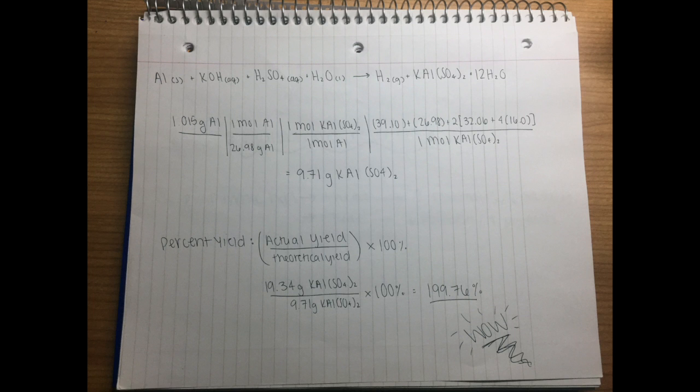Then, to actually calculate the percent yield, you must divide the actual yield by the theoretical yield and multiply by 100%. Our actual yield was much greater than the theoretical yield, giving us close to 200% as the percent yield. So how did that actually happen?